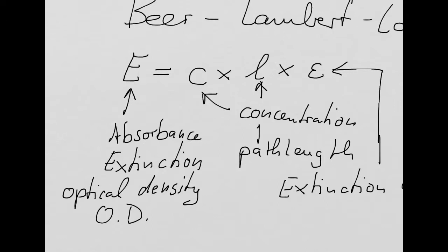Okay. And you can look up these extinction coefficients in books and so on. But what if you do not have an extinction coefficient? You can't do anything, unless you are very, very clever.